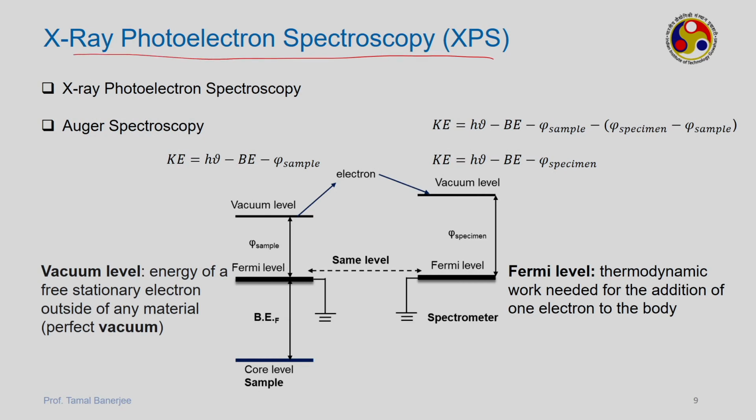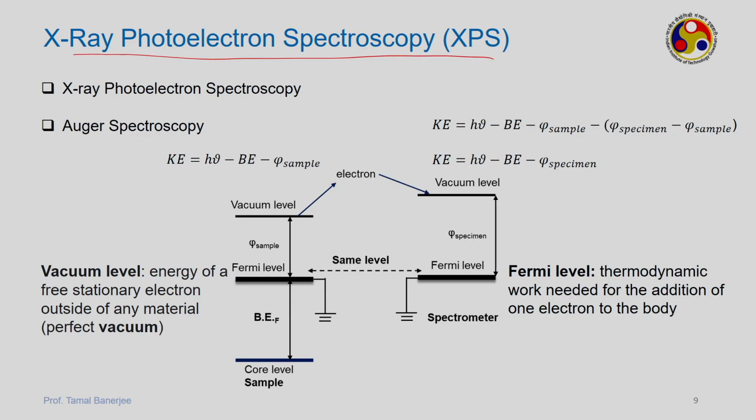Not many institutes have this instrument, because the cost is pretty high, and you need an ultra high vacuum to maintain, because here we are actually analyzing electrons, the kinetic energy of electrons. So, there should be perfect vacuum. So, that is why there are fewer of these instruments as compared to the other instruments which I have taught.